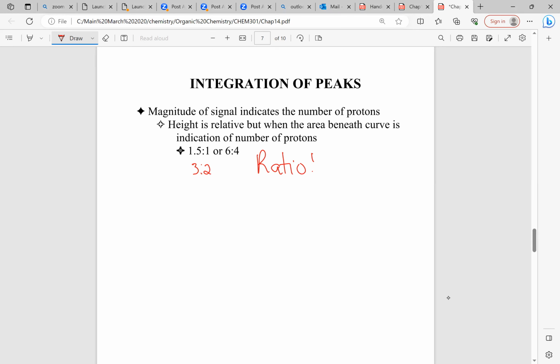What you're going to see is something like this. There will be a peak, and let's not do red. All right, so we'll say we have a really tall peak, and you don't know about the splitting yet, but that is a peak. It's called a triplet. And then the computer will integrate this. And luckily for you, you don't have to determine the area underneath it. We used to have to do that. But from here to here, the computer will ratio that, and then it will also integrate from there to there. And then it will compare the two sizes.